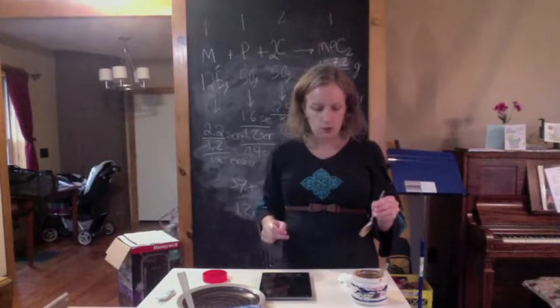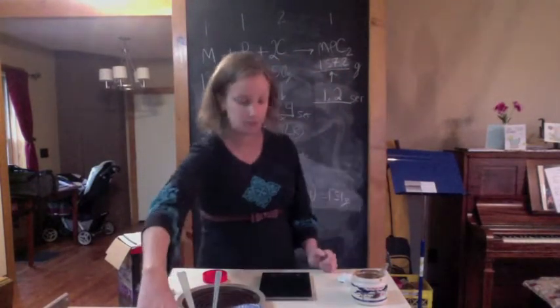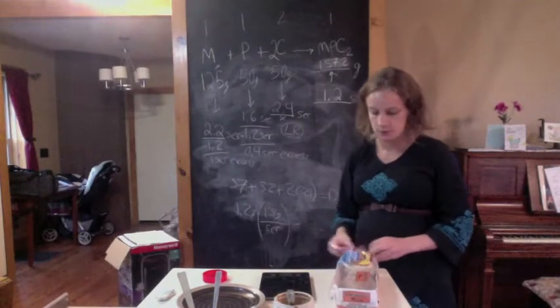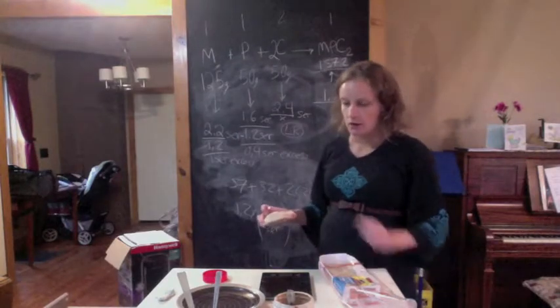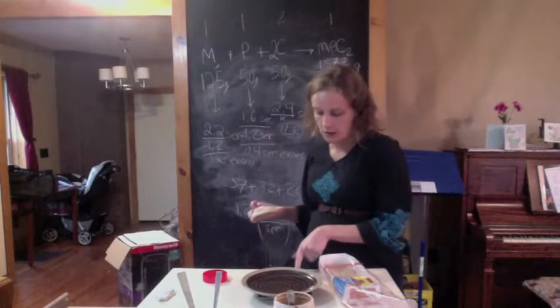And the next thing we need to weigh out is our muffin. So they tell us we have 125 grams of English muffin. And I can put that right on the scale. Well, I'll put it on a plate. Okay, so I'll put the plate here, hit 0.